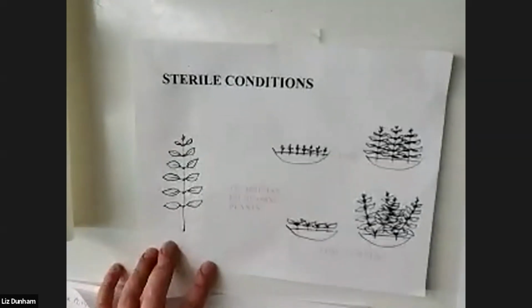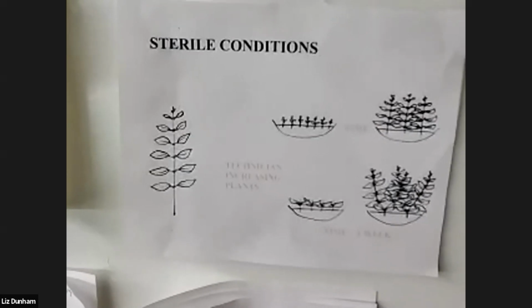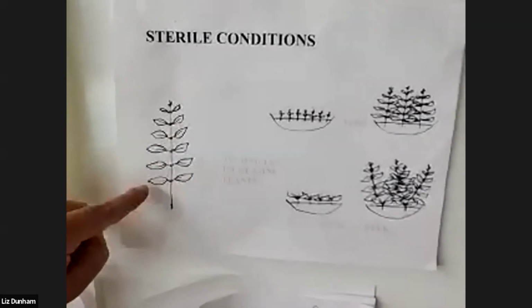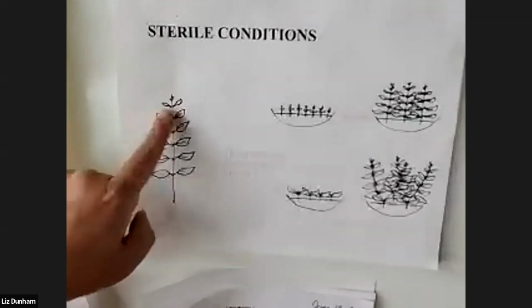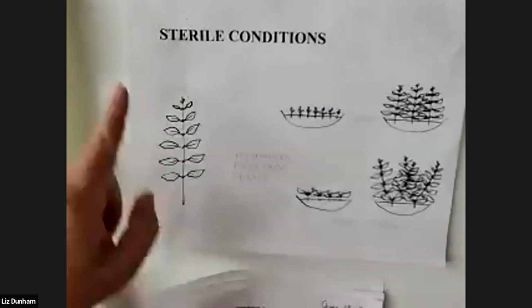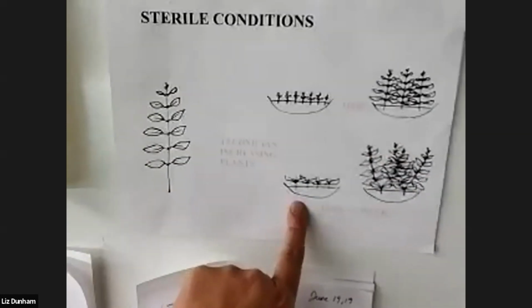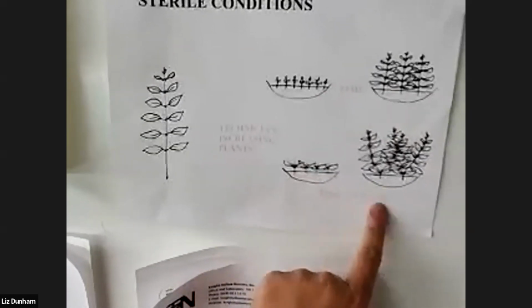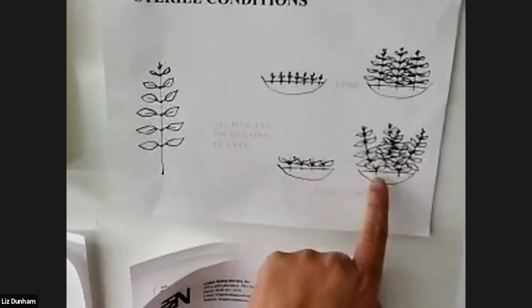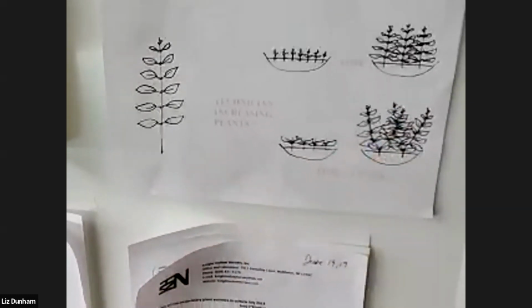The other graph that I have here is pretty simple, and it's a lot like taking cuttings in a greenhouse, softwood cuttings, hardwood cuttings, whatnot. So we have in our hood, let's say this is a lilac. Here's the cutting, and we're gonna cut at all of the nodes. And like I said, we're gonna separate the tips versus the mids, because the apical dominance is going to have the tips grow faster. And the mids are gonna take a little bit more time, so time plus a week. But if successful, they will grow hopefully from each of the buds at that juncture.